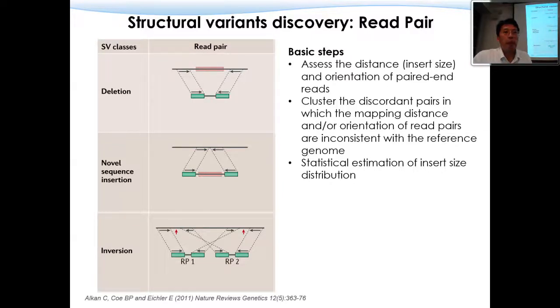And that is not happening because it's not possible, because your assay, your DNA fragment is only by average 500. So the only conclusion for this, or possible fashion that this will occur, is there is a big deletion in the middle. Okay, so that is the type of information people will use.